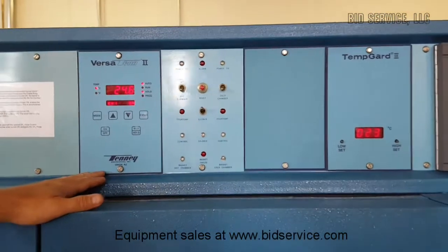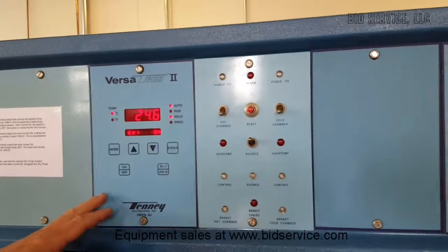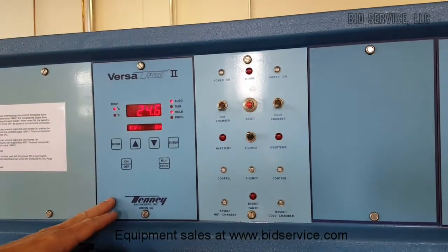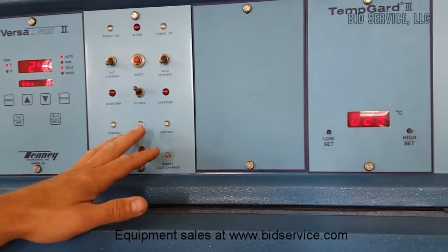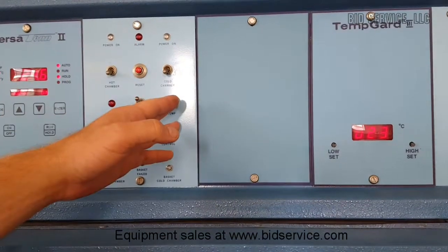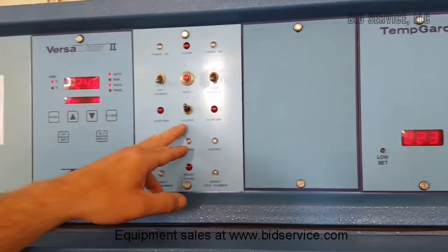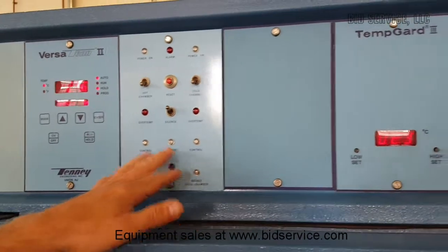This is the programmable Versa 10-2 controller. You can operate the system in manual mode or you can store up to ten programs in the system. This is the power switches for the chamber — you can have one side or the other powered on. You have alarm, silence and reset, and then just indicators of where the basket is and what's controlling.